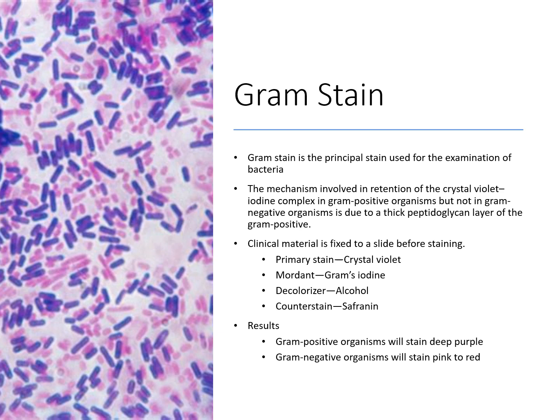When you use the stains, the crystal violet stain forms a complex with the iodine, and this will be present in your gram-positive organisms, whereas your gram-negative organisms do not have that thick peptidoglycan layer, so they are not able to retain that iodine complex to stain that purple color. They would be gram-negative and they would be pink.